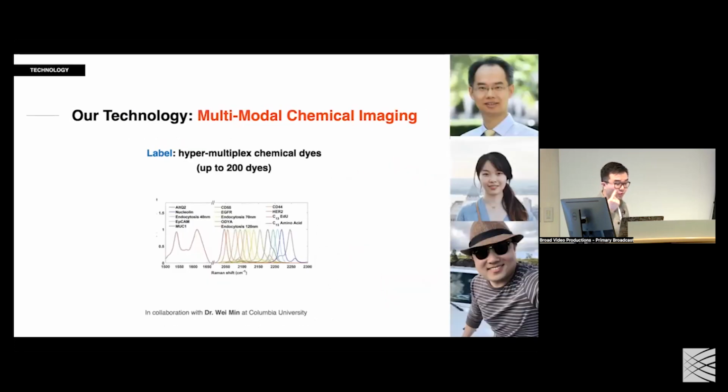And another way that we're thinking about this is that all the imaging methods that we're talking about are label-free imaging methods. You don't need to do any staining. Once you do the staining, you will have some perturbations to the system. But as a compromise, we're also thinking about how to scale up with labels. For example, if we're using fluorescent labels, there are 5 different colors. And sometimes, if you use a fancier microscope, we can probably push to 8 different colors.